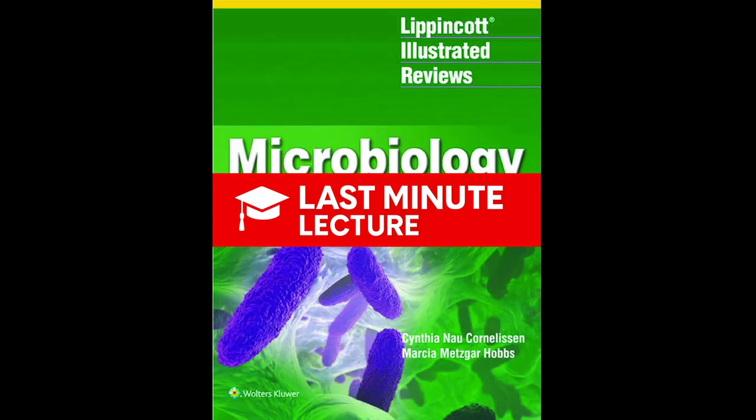This is where the separation happens. Gram-positive bacteria have this thick, spongy cell wall. Think of it like a thick mesh. It just traps that purple dye. The acetone can't wash it out. But the Gram negatives have a really thin, flimsy wall. The acetone just strips that purple dye right out. They become invisible again, which is why you need that final step, the safranin. Right, the pink counterstain. The now naked Gram negatives soak that pink dye up. So you end up with purple bugs and pink bugs. Gram positives are purple, Gram negatives are pink, and that simple difference is huge clinically.